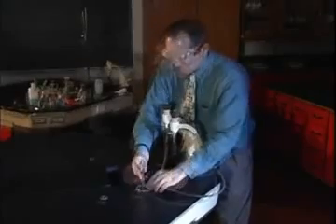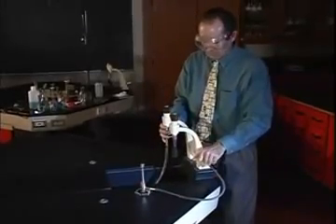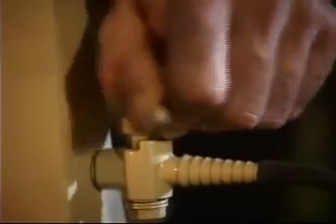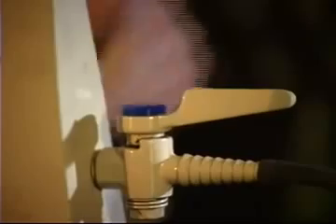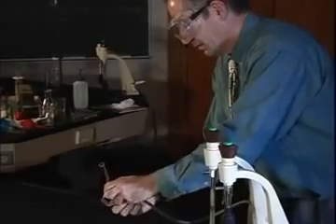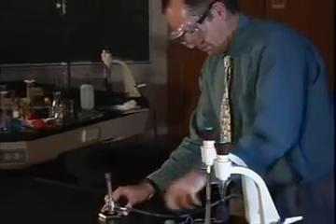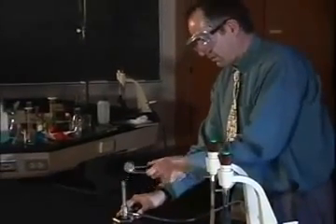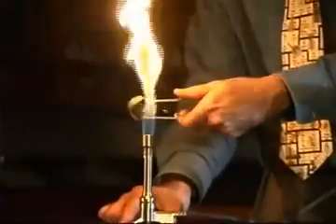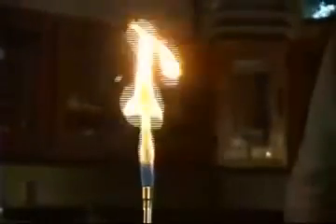Before opening the gas outlet, make sure you have a striker and are wearing eye protection. Turn the gas outlet on by moving the handle parallel to the nozzle. Open the gas flow on the burner slightly, two or three turns of the thumb screw. Position the striker on the side of the burner — never over it for safety reasons. One or two strikes should light the burner.